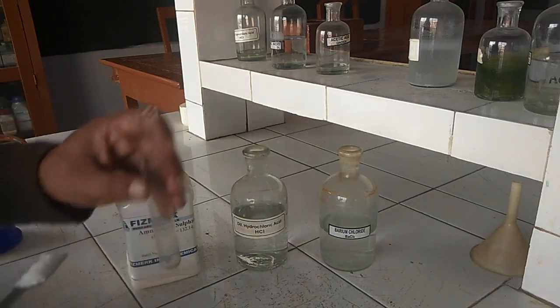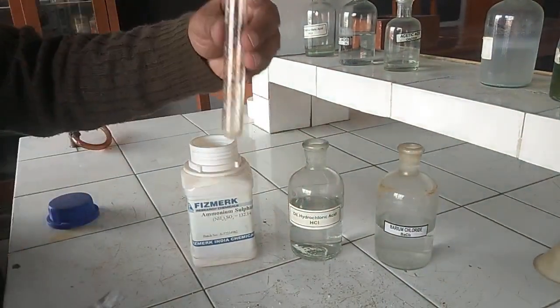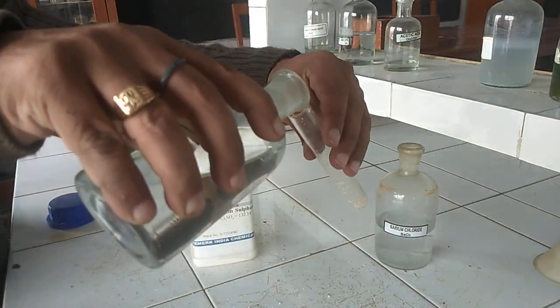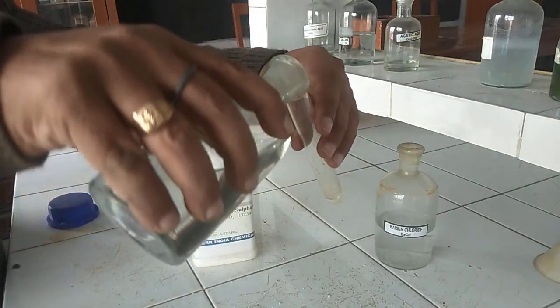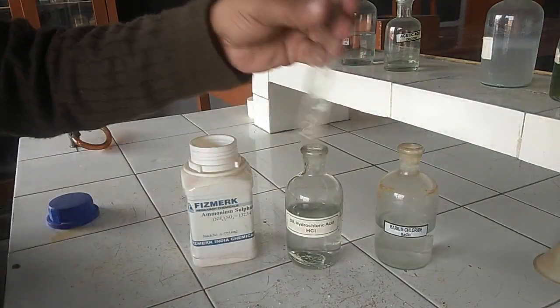We start the test. For this we take some amount of salt in the test tube. We will add dilute hydrochloric acid, or HCl, to this. We will shake the test tube a bit so that the salt gets dissolved in the acid.